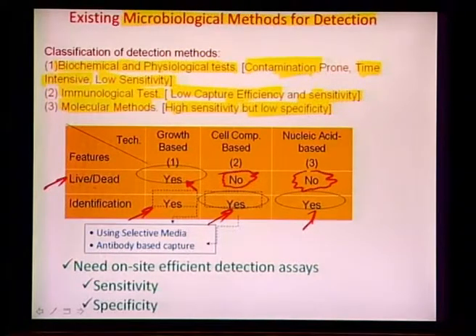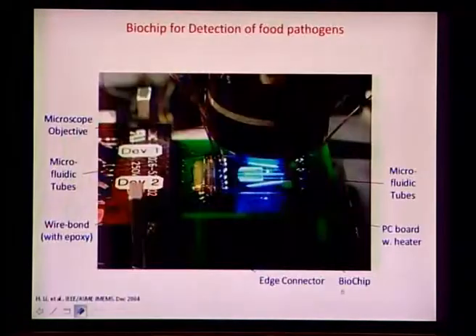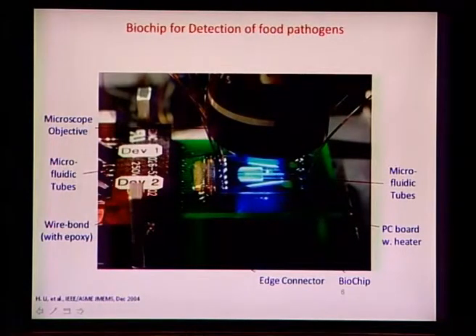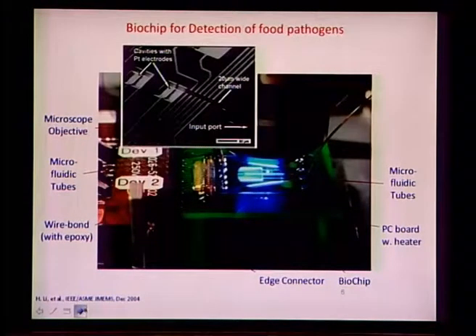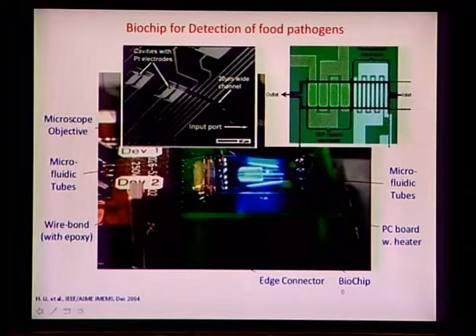Okay. So, essentially the idea is to be able to plug in all these things together on a single microchip, so that you can actually sensitively and specifically detect on site the bacteria or pathogen load on a particular media. So, this right here illustrates some of the pictures which are borrowed from this. This is actually a microchip borrowed from Dr. Bashir's group, and essentially this shows how this microchip has been constructed or realized. This is the small chamber which is only about close to 1 picoliters, okay, and essentially it is realized in silicon.